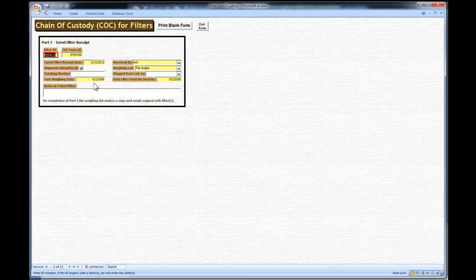And that's important to validate your data because PM2.5 is so volatile that you really need to reweigh the filter if it hasn't been exposed, because the filter can actually change in terms of the amount of moisture it takes up, etc. So there's a lot of requirements for PM2.5 filters.